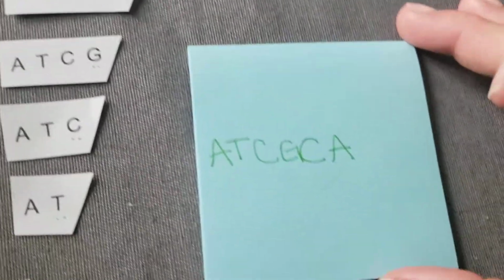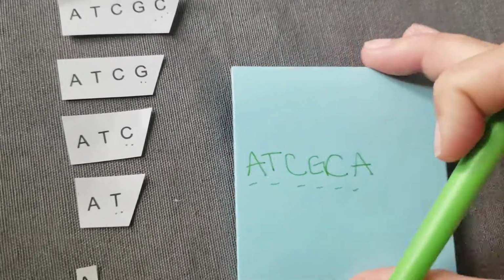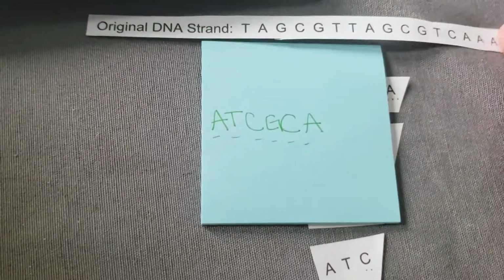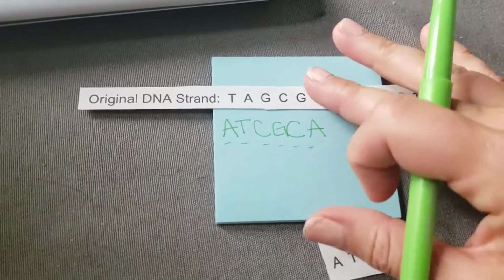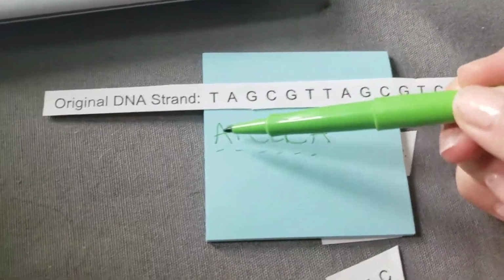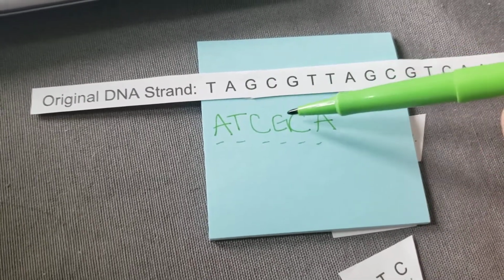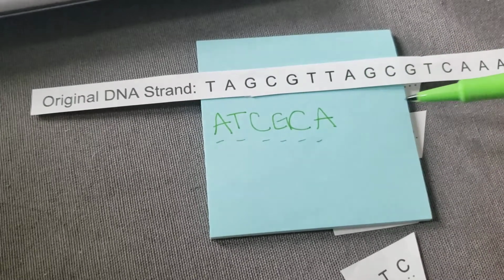And what we're really doing here is we're crafting the sequence of letters that correspond to our original DNA strand sequence. So while I haven't done the entire thing, look at that correspondence there. A with the T, T with the A, C with the G, G with the C, C with the G, A with the T, and so on all the way down the line.